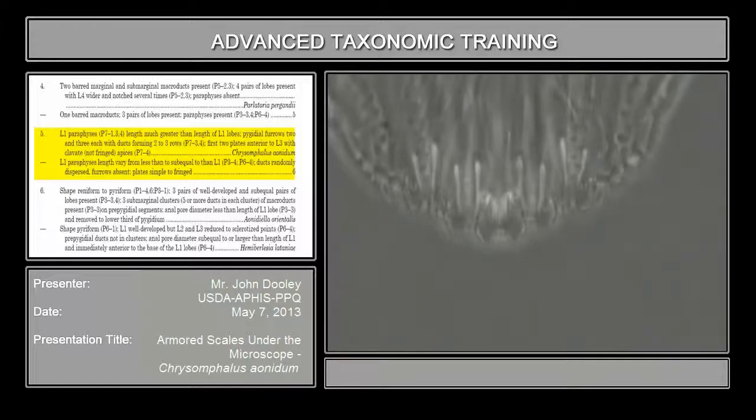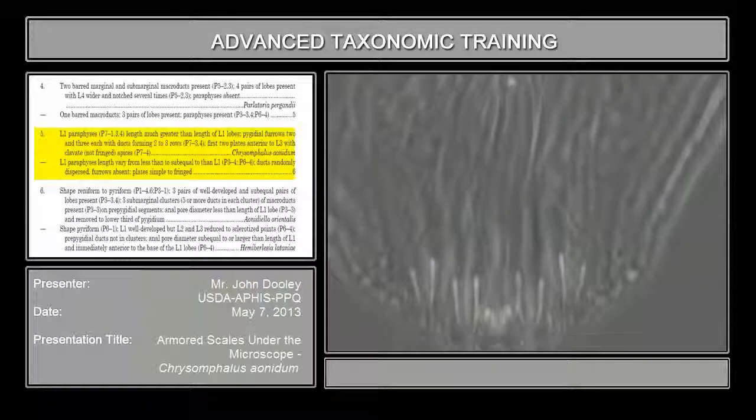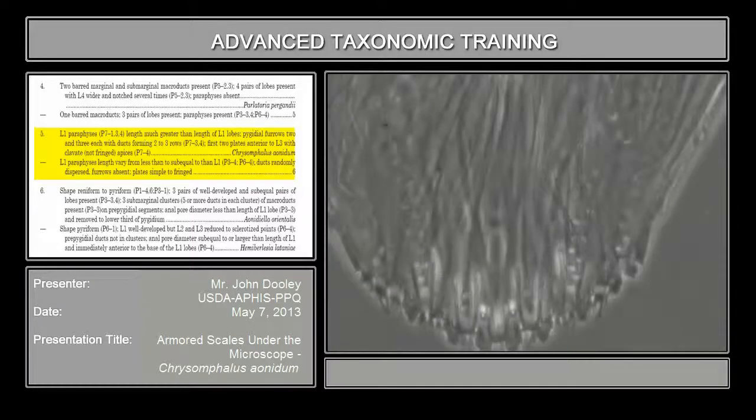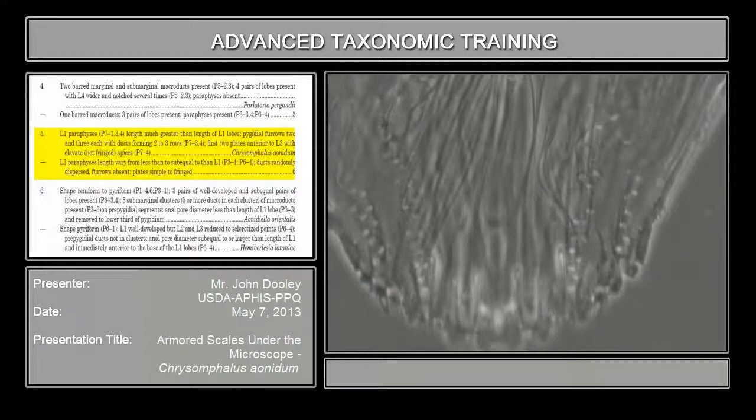This one they call Chrysomphalus aonidium because of that one cluster above the pygidium that I showed you earlier. It has two or three on each duct forming, and then it has pygidial furrows. You see how these ducts are coming up this way and they're forming elongate tubes going way out? Here are the orifices — or actually these are probably the bases. The point is that they're forming like a series or a row, anywhere from two to three wide, two to three rows. And that is also very important.